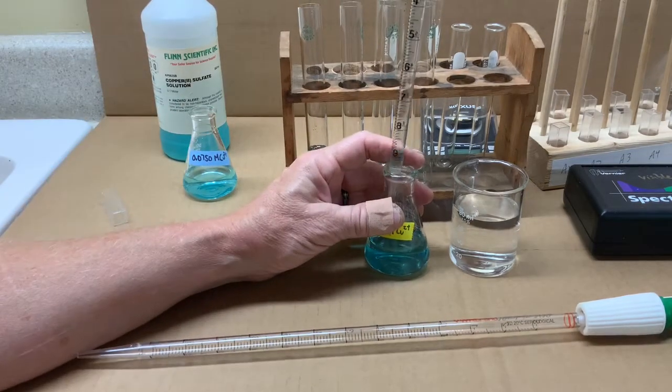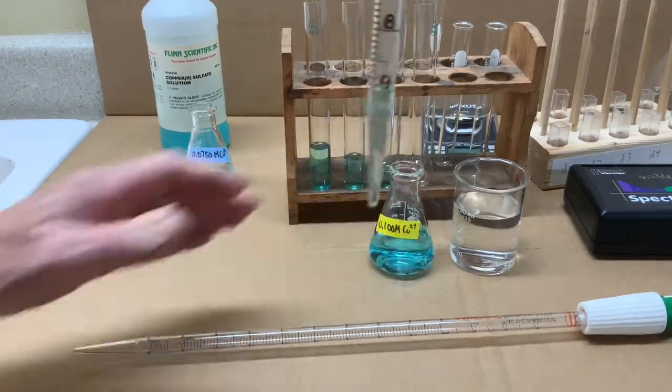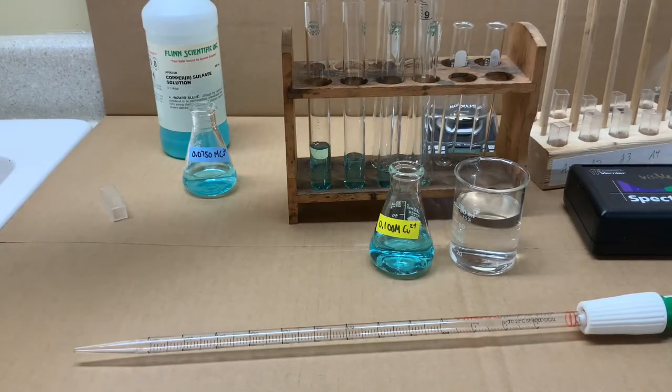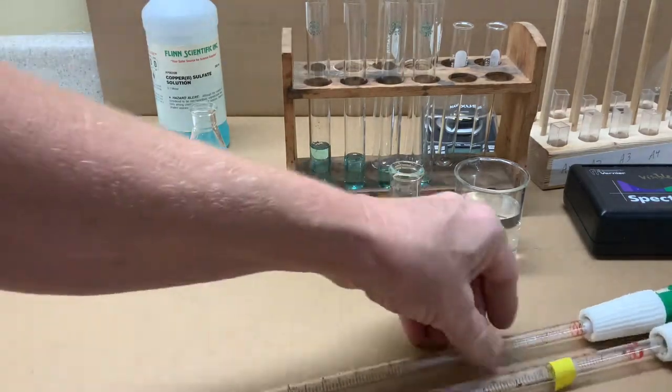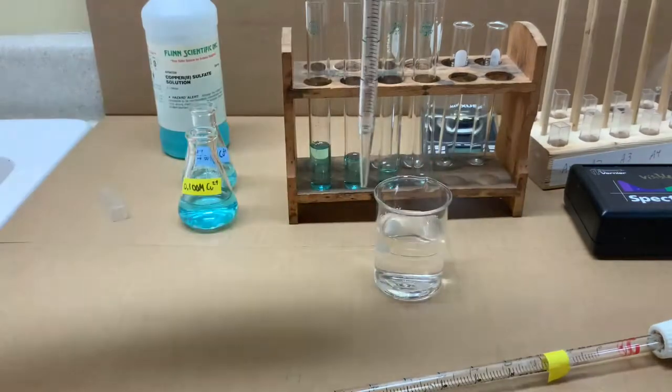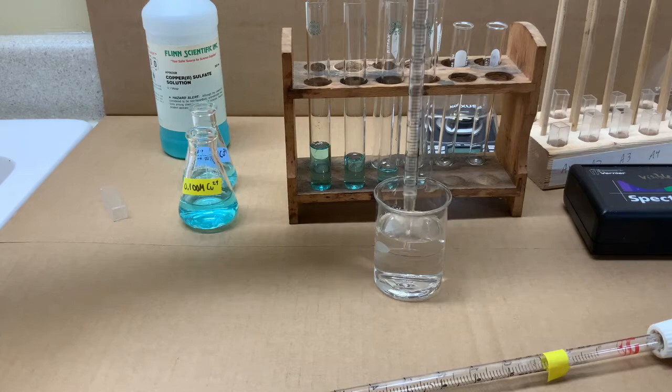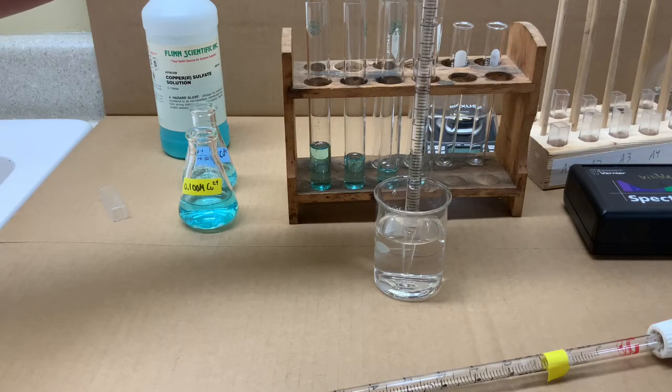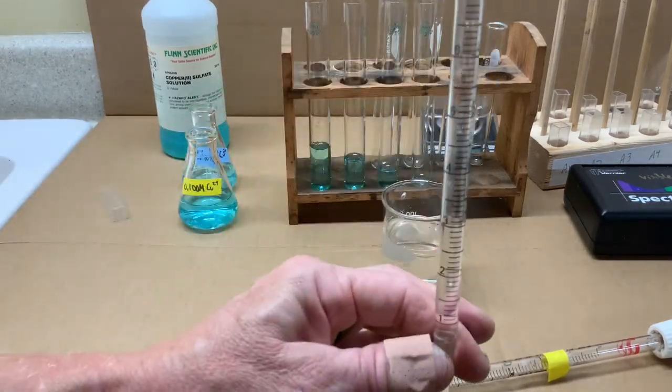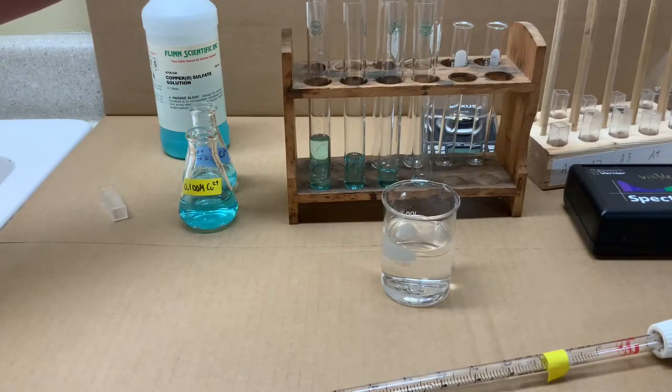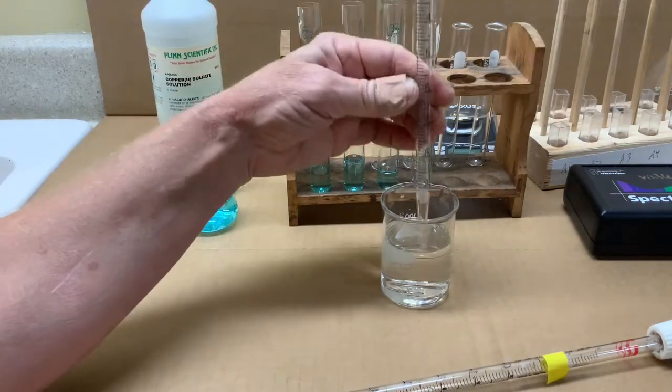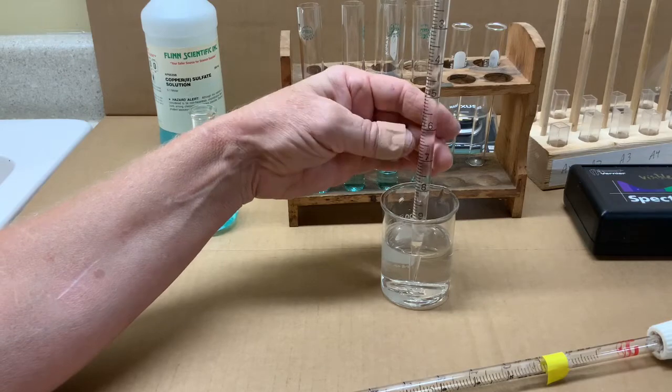And the fifth solution will be 1 milliliter of stock and poured in. Then changing pipettes and water will be drawn. So in solution 2, we'll draw up 3 milliliters of water to add to the 7 milliliters of stock solution.